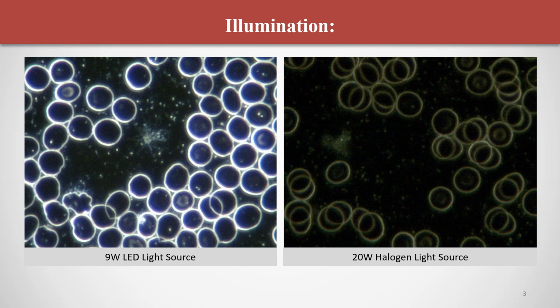And this is a very common pitfall. A lot of practitioners, because of the low cost of these other microscopes, end up getting them, and they realize that they're really not able to see anything. They find that they're not really able to use them in practice, because they are missing so many anomalies. And then it's a case of having to try and sell a microscope, which is quite difficult. There's not a huge market for Darkfield microscopes that don't really have the correct features. No, of course.